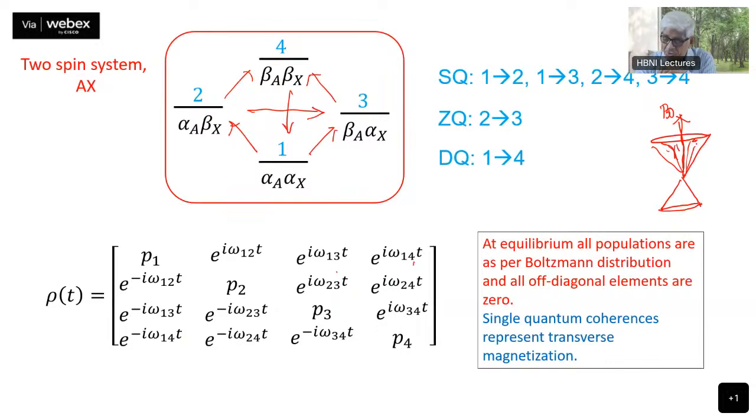Now, if I take a projection of all of these components on the XY plane, I will have projections like this, like this, like this, right? And all of these transverse components will cancel because there are so many, and there is no phase relationship between this transition and this one or this one or this one. They can be anywhere in the transverse plane.